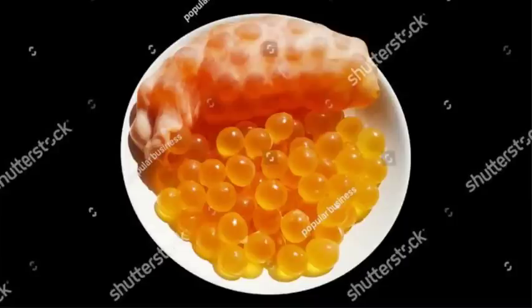It is transparent yellow or golden yellow, very small, but it is in several masses. In fact, the organism lays this egg in several masses, and it is transparent. It appears that you can look through the egg, and the egg is without a shell.